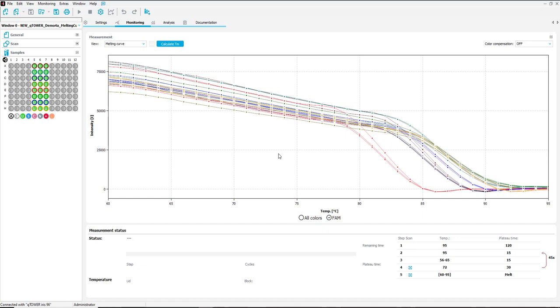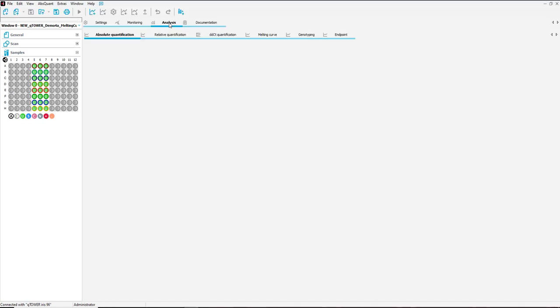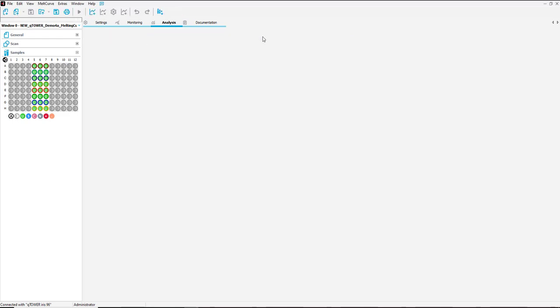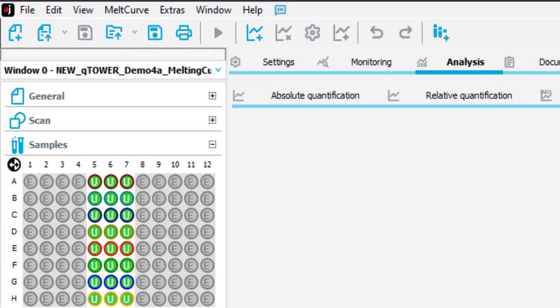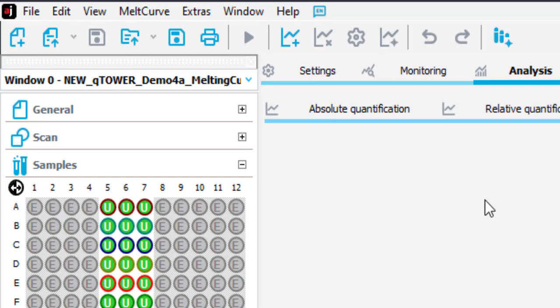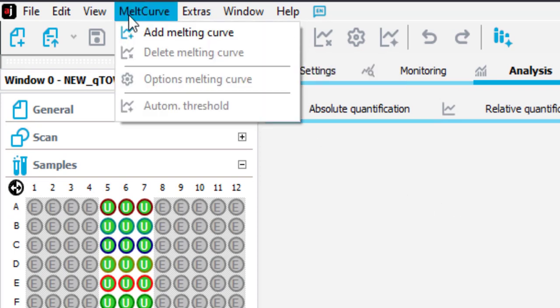And now we want to have a look on the melting curve analysis. Click on the melting curve tab and add a new melting curve analysis via this icon or the drop down menu.